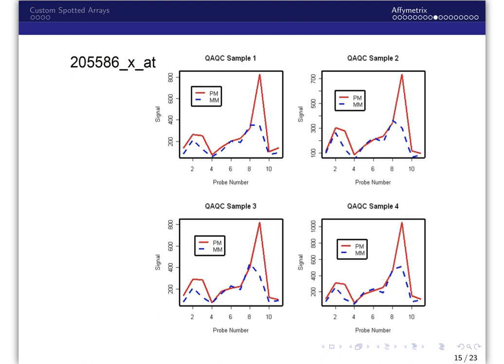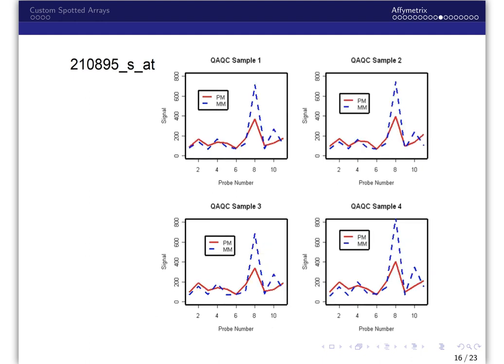That is, the same sample was hybridized to all 4 gene chips, and the probes vary more among themselves within the probe set than the probes vary between the 4 different samples. This figure demonstrates that same observation.